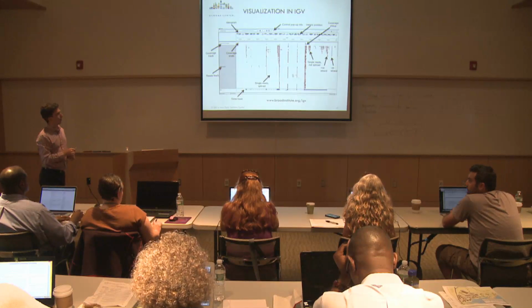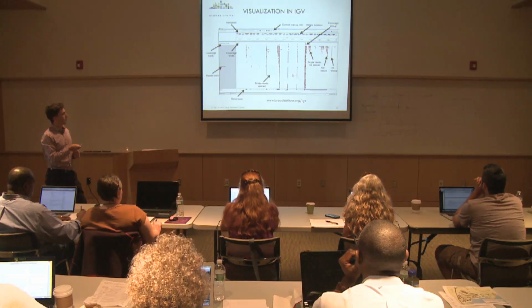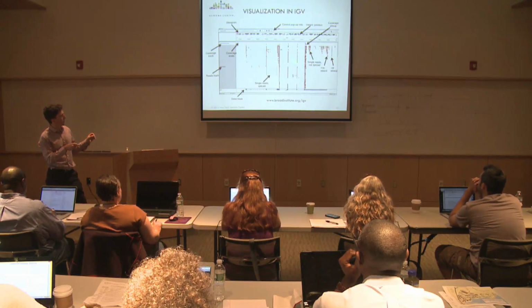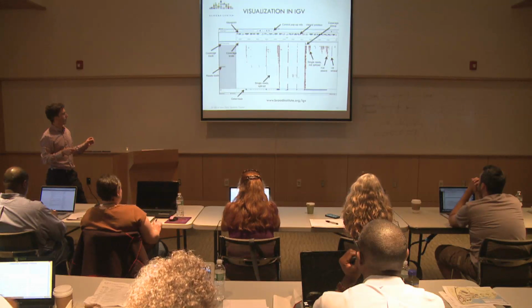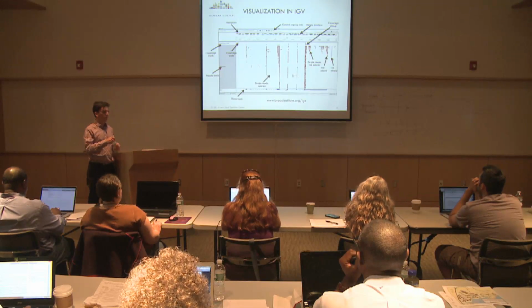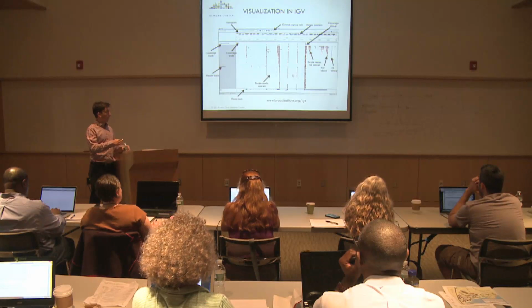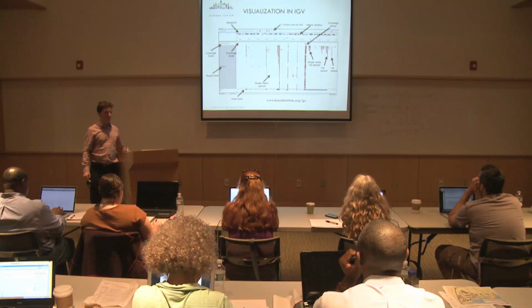Here, that's positive strand and negative strand. So here it's probably a stranded protocol, okay? The coloring depends on the orientation of the reads. The red are probably in the same orientation as the gene, and the blue correspond to a transcript in the other orientation. Does that make sense? So that's positive and negative strand on genomic DNA? Yes.